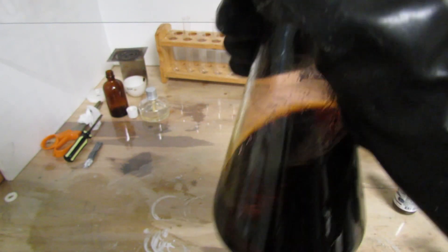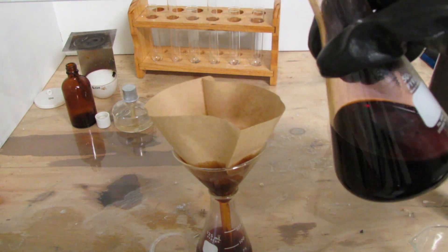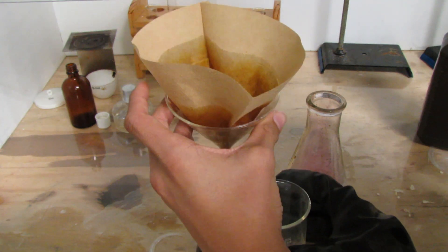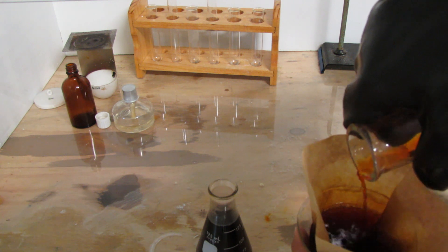Swirl the flask to ensure that it is fully reactant. Now pour off the majority of the liquid. I'm pouring it through a filter just in case there happened to be some iodine suspended in the liquid. That way it won't be wasted.